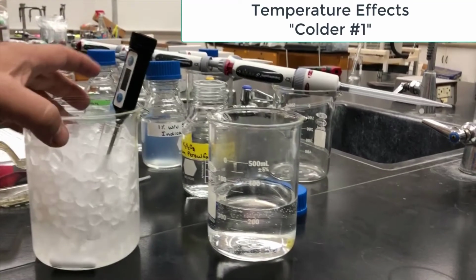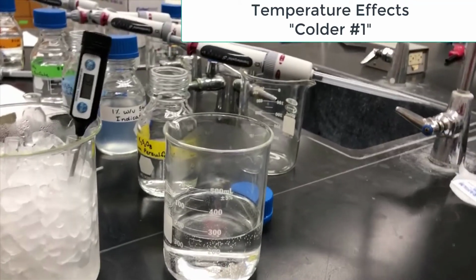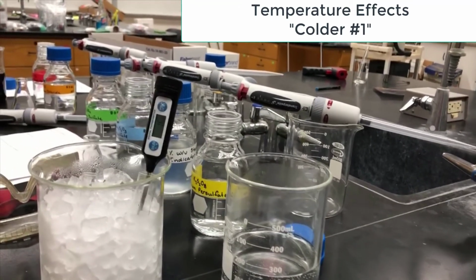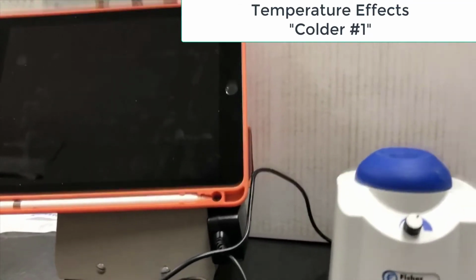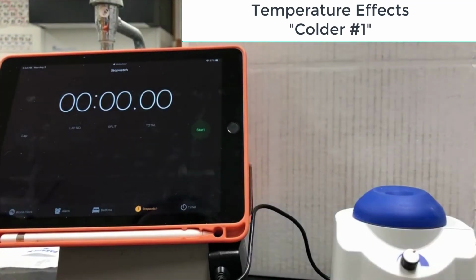Okay, so this is going to be the next trial for the temperature trials, and you'll notice I have those two stuck in test tubes. Currently, the large test tube is measuring at 1.6 degrees. That actually took about 3 or 4 minutes to get to sort of a stable temperature. So what we're going to go ahead and do is do what we normally do. We'll mix the two together and record the time it takes for the color to change.